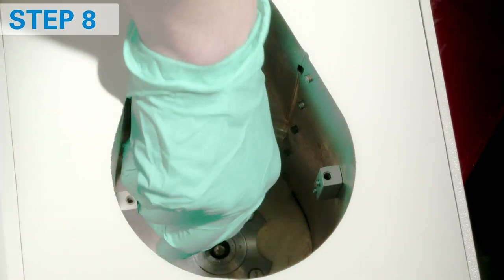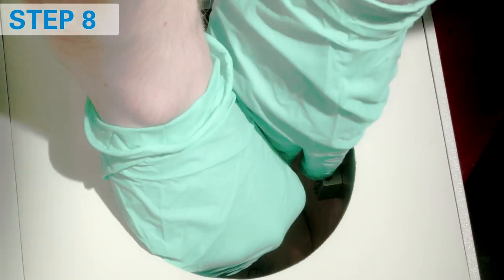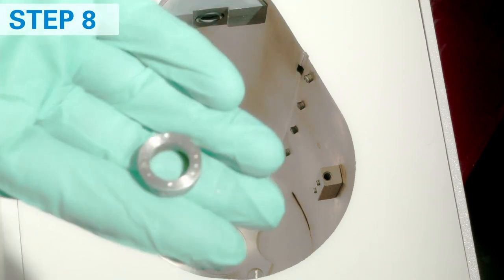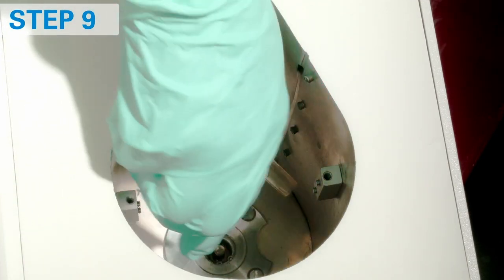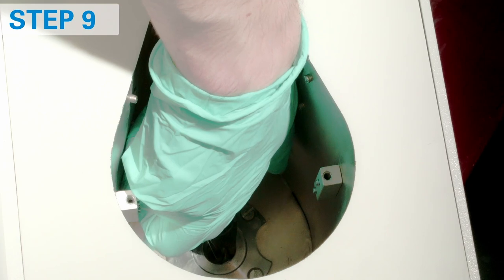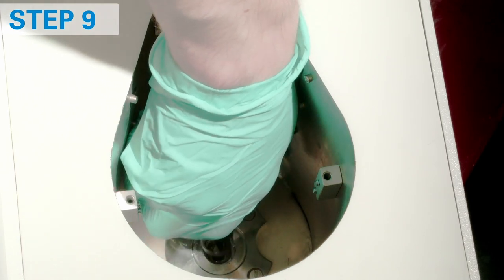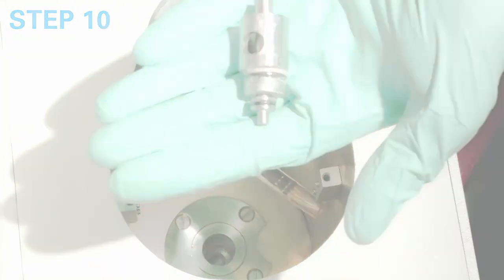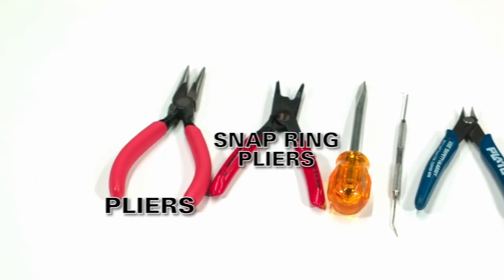Remove the white washer. Using snap ring tool, remove the metal spacer — create force by opening the tool. Remove the snap ring using the snap ring tool. Remove the assembly by pulling the shaft using pliers. Then remove the metal spacer.